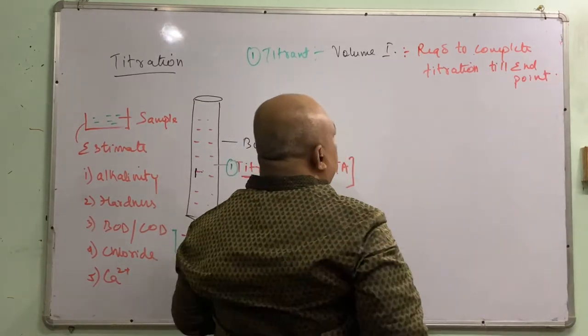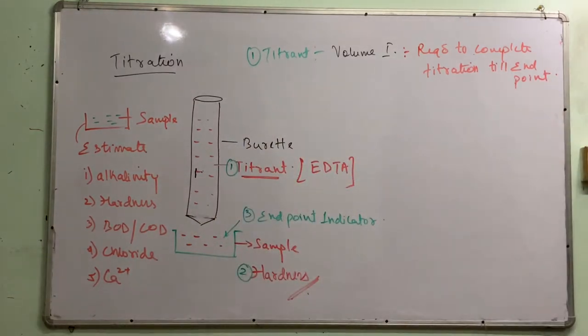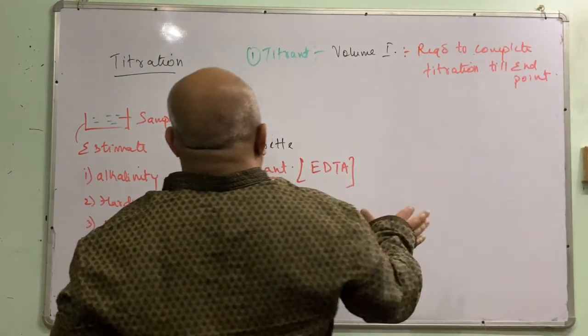Okay. Just a second, please. To complete the end point, plus low wave. Some disturbance was there from the other side, that's why. So now the video is still keep on going. Fine. So required to complete the titration till the end point.